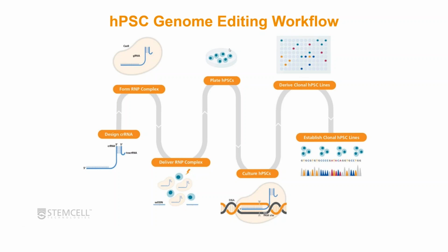And then we've optimized post-editing culture conditions so that you can derive clonal cell lines and then establish those lines. And so I'm going to go through each one of these stages step by step in the subsequent slides.